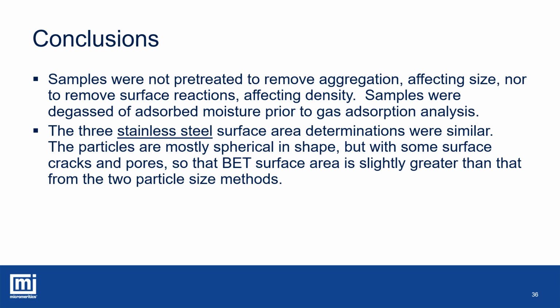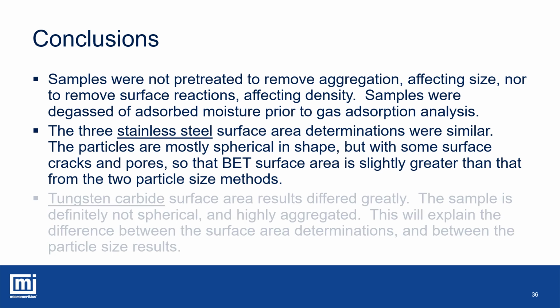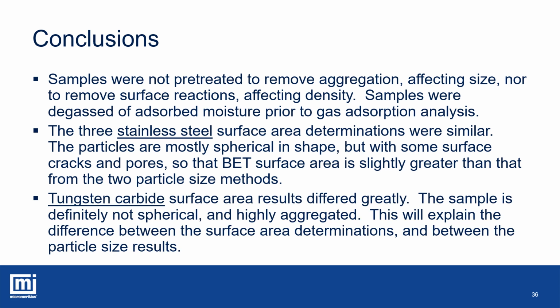Tungsten carbide surface area results differed greatly. The sample is definitely not spherical and highly aggregated. This will explain the difference between the surface area determinations and between the particle size results as well.